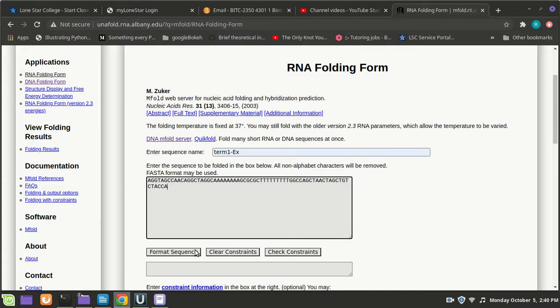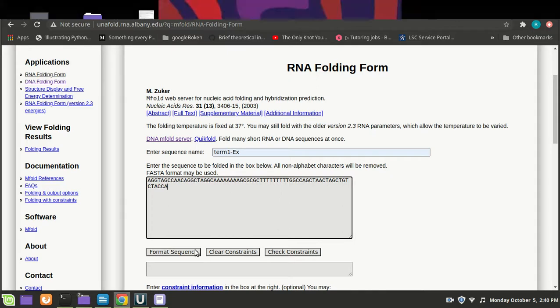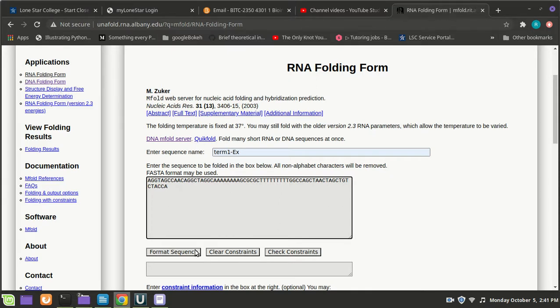You'll be doing this with the lac operon. You'll be going to those regions that you've identified in between Z, Y, and A, or at the end where A is. There's a piece between Z and Y, a piece between Y and A, and then at the end I'll actually give you a paper that tells you what the final one, the A terminator, is. You should take that piece and run it in here just to confirm that it says the same thing the paper says.